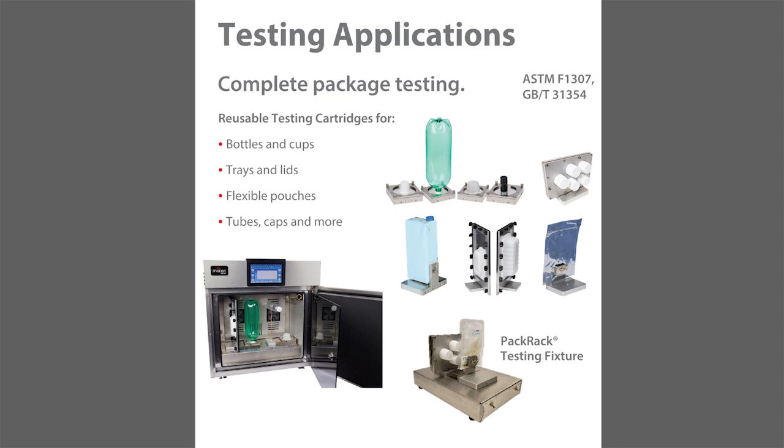The schematics I showed you before talked about film structures mounted into a cell, but actually we do a lot of testing on bottles, on pouches, on trays, on capsules, on anything, syringes, polymer syringes versus a glass syringe, corks, and the like. If I zoom up a little bit here, here's an example of some open-mouthed packages, and they're mounted to something that's going to allow us to purge nitrogen inside of them. Then we can surround the exterior of them with a controlled humidity or controlled oxygen environment for either oxygen or water vapor test.